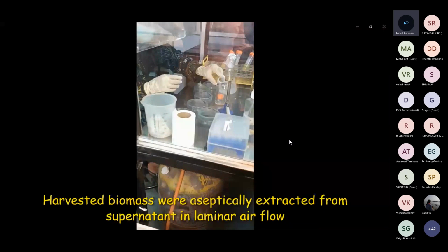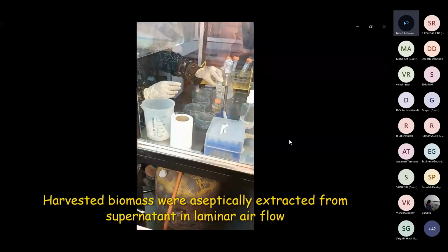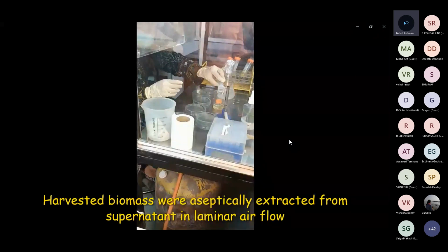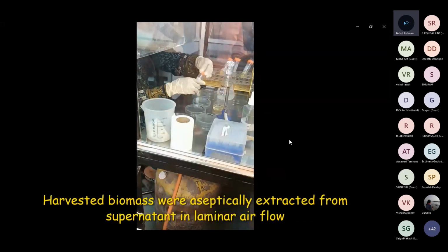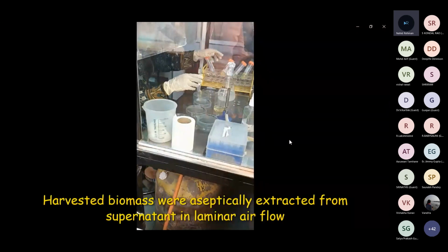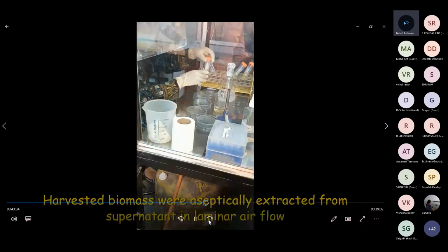Now she is discarding the supernatant. She will do it for all.